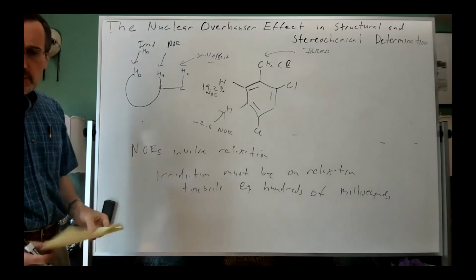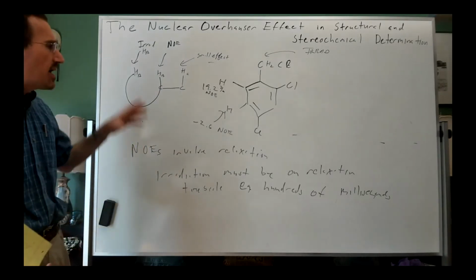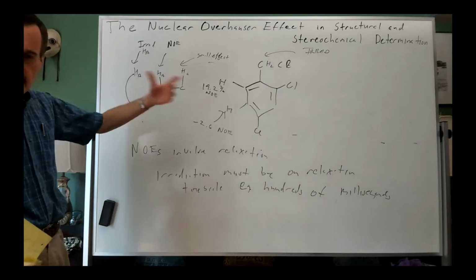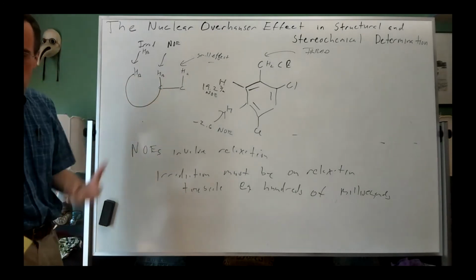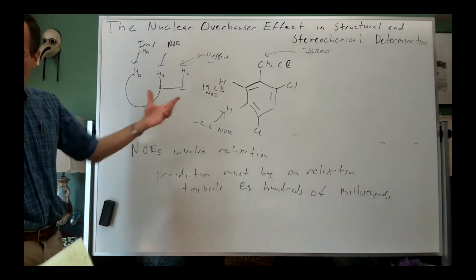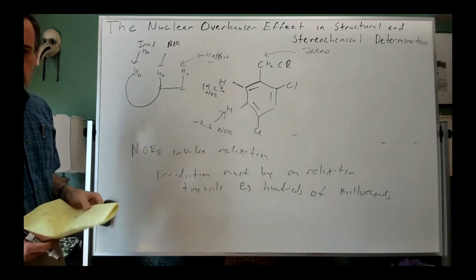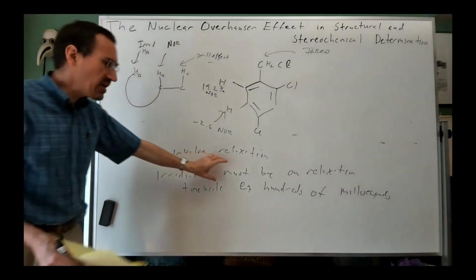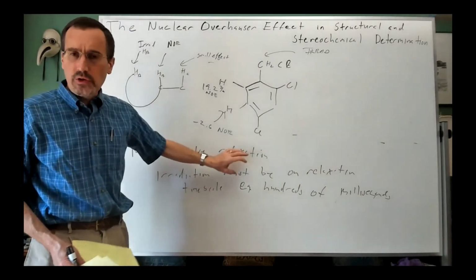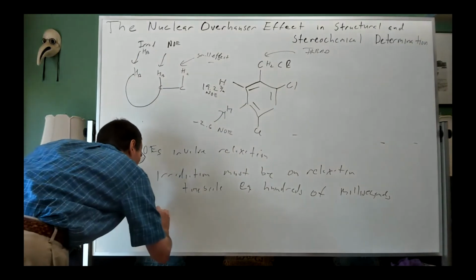But for a newbie, when you're using the NMR spectrometer, often for the first time, and collecting a data set, and there are all these different parameters, and you've never done this before, and you just sort of plug in the default value because you don't know what all these parameters mean, realize that the irradiation time, or in the gradient experiments, it's called a mixing time.